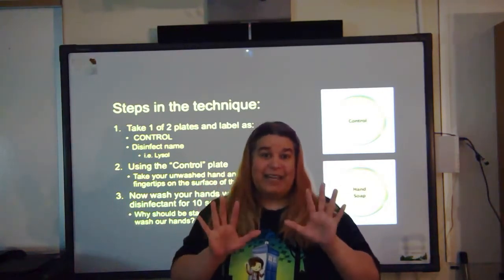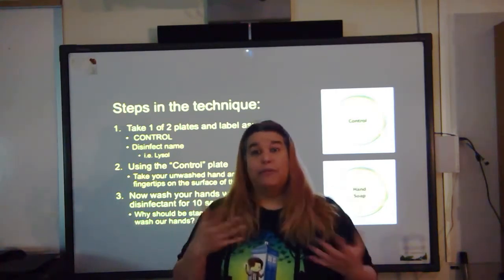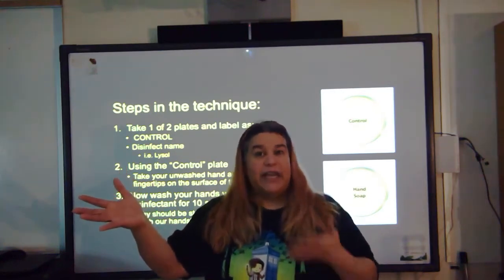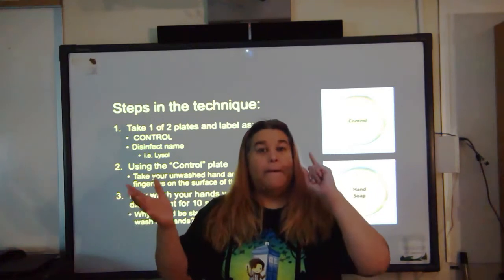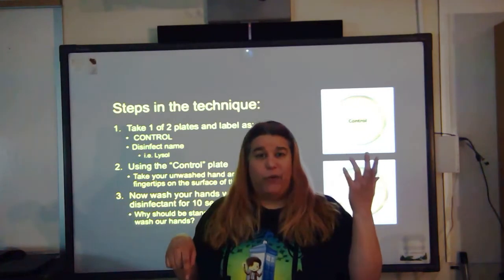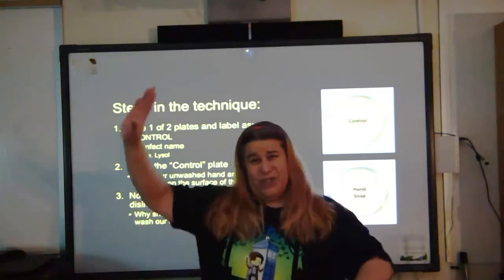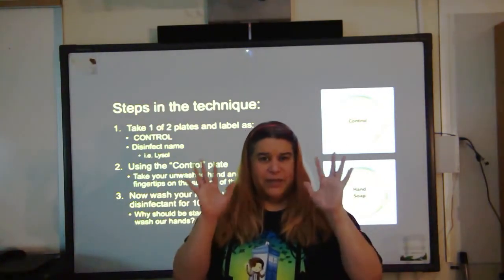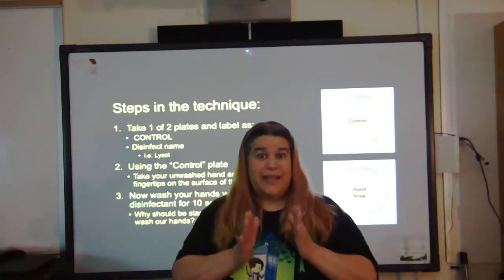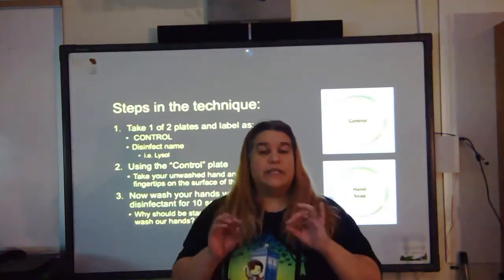And again, 10 seconds is a really standard time so that it's not variable, because I'm sure that if I went and washed my hands for 10 minutes with hand soap, it would be highly effective. 10 minutes of washing my hands, of course. But if I only used, let's say, the mouthwash for 20 seconds and I've got so much growth, that's a huge time difference as far as the product staying on your hand. So what do we do? Well, we standardize that time.